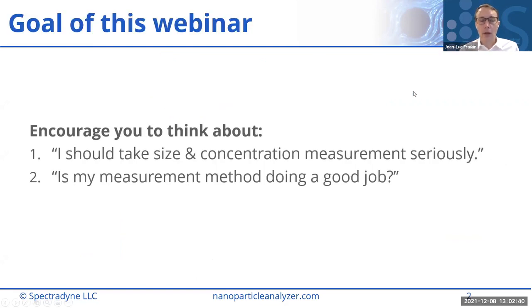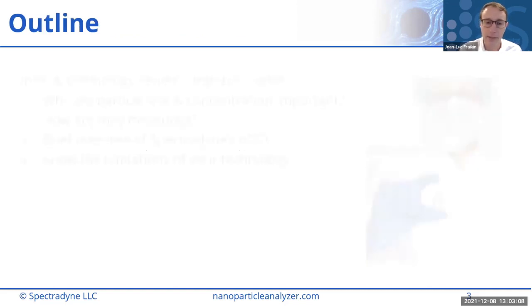So our goal for this webinar is to encourage you to think about two things. First, that you should take the size and concentration of your particles and the measurement of those parameters very seriously. And I hope I can convince you of that today. Secondly, I want to get you thinking about whether your instrument, your measurement technique, is doing a good job and is appropriate to give you the results that you need.